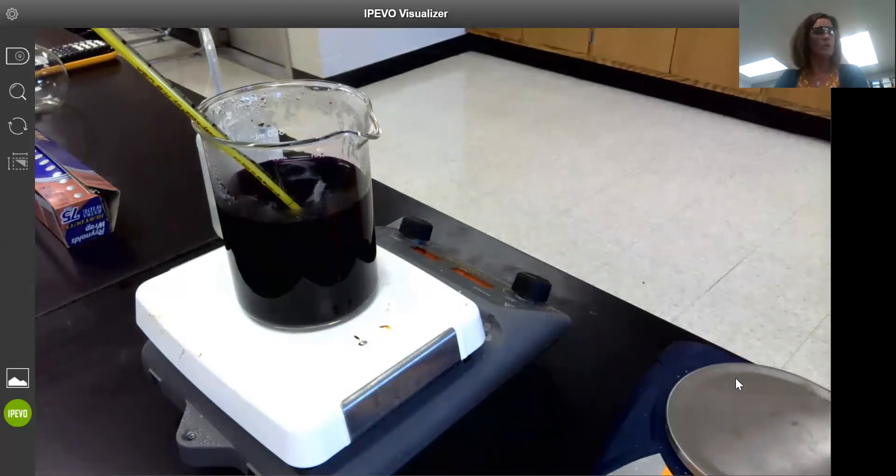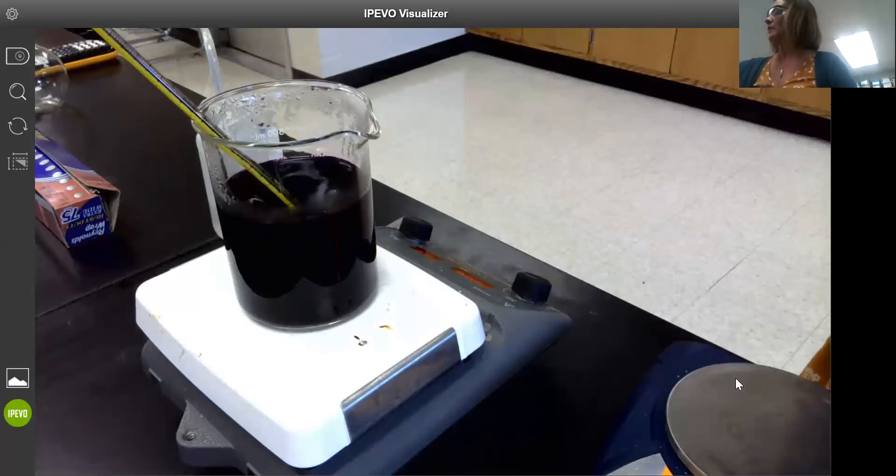That's what we're going to be doing in class next week. Today when I'm making my KMnO4 solution, I just want it to be close to 0.02 molar, but I'm going to be determining the exact molarity of this solution in the lab when we carry out the titrations.